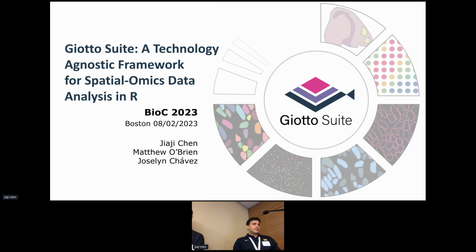So I have some questions related to how Giotto can be used for images only. I guess for the data size of the packages, experiment packages have a larger file size limit. That's a limitation for Bioconductor. But going back to my question, for example, I think you mentioned Cellpose, how you can incorporate segmentations from Cellpose. Yep. So you could use, for example, an H&E staining image from Xenium, you can run Cellpose, get where the cells are located.